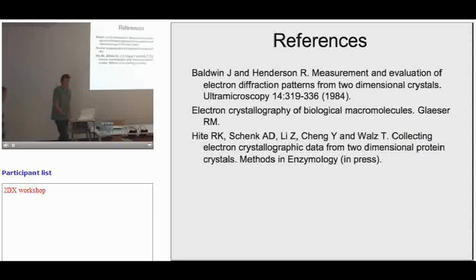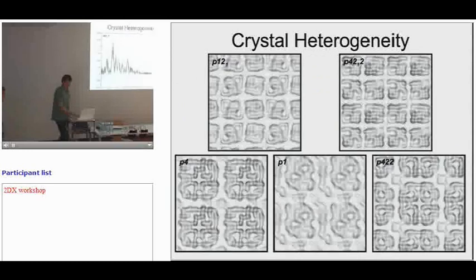So some of these crystals that have the lower symmetry, like this P121, have a fourfold non-crystallographic symmetry. And that one may be possible to use phase extension to extend from, say, 5 or 7 angstrom from images to atomic resolution. But because we already have the phases for molecular replacement, I don't collect images at all. The first images that I had to collect were to try to segregate these different crystal forms.